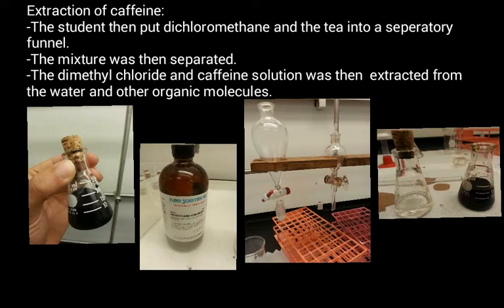The mixture then separated into two different layers. Since the dichloromethane has a higher density, it stays on the bottom with the caffeine. The other organic materials stay on the top layer, bonded to the water. The dichloromethane and caffeine solution was then extracted from the rest, which was a clear and colorless solution right there in the corner.